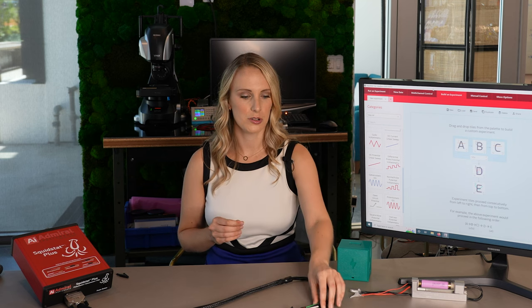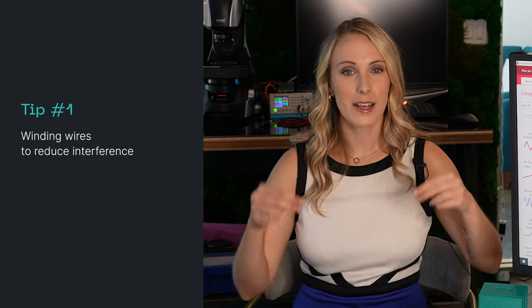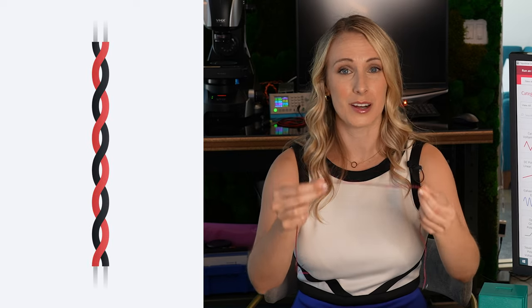As you're setting up, one of the things to particularly pay attention to is what are your cables like and how are they going to be interfering with the signal? As current passes through wires, it creates a magnetic field that can then interact with the current of another wire. To reduce any of those capacitive or inductive effects, you can wind cables together like this. Winding or twisting cables together is a great way to reduce any capacitive or inductive effects.